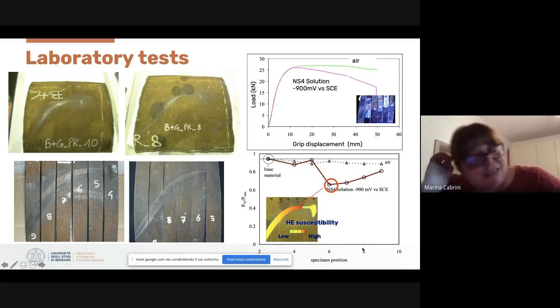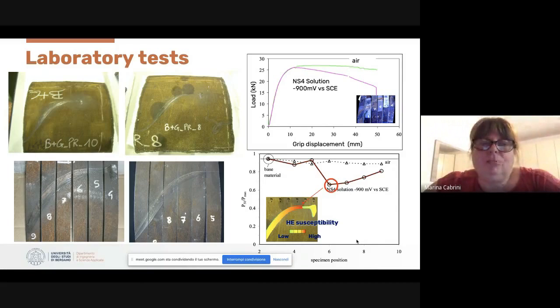These are interesting results, but they also have another problem. It is not possible to separate the effect of the cold hardening of the specimen and the geometry of the defect on the hydrogen embrittlement.